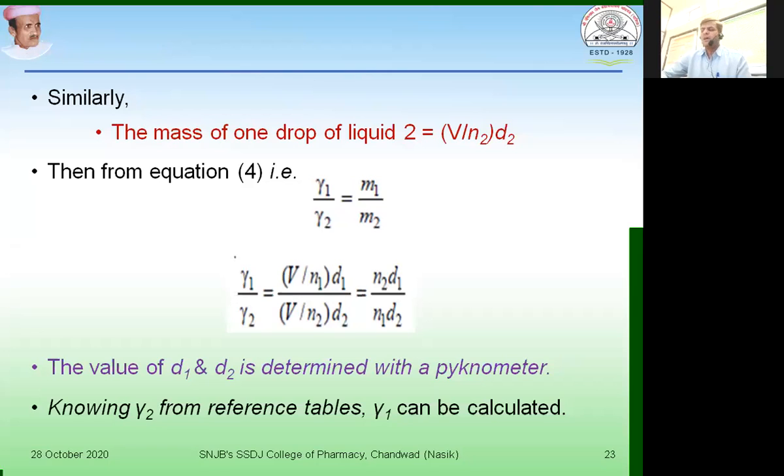The procedure remains simple and the same as we have used for surface tension. In case of surface tension, drops are allowed to be formed in air. In case of interfacial tension, one liquid forms a drop when it is in contact with another immiscible liquid.